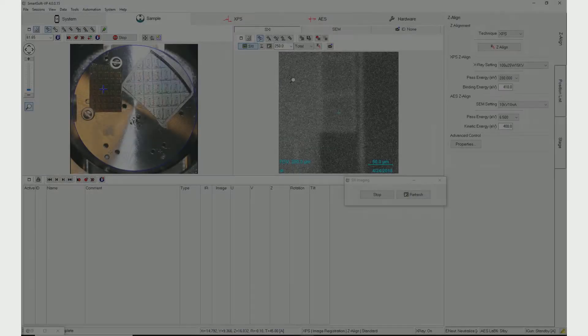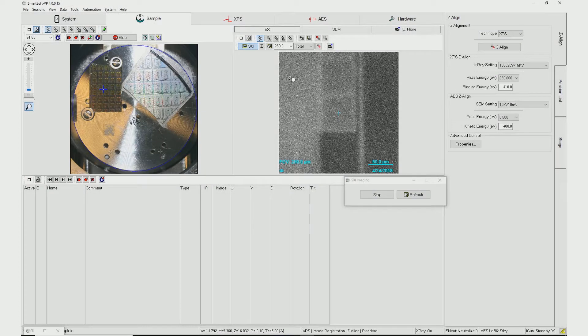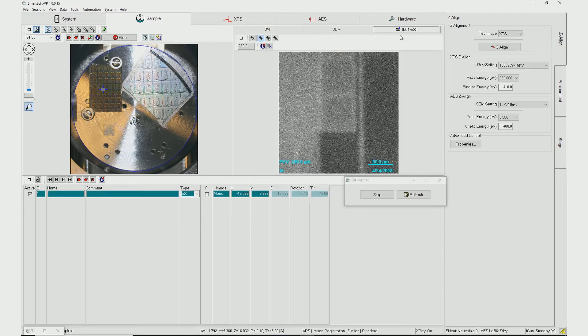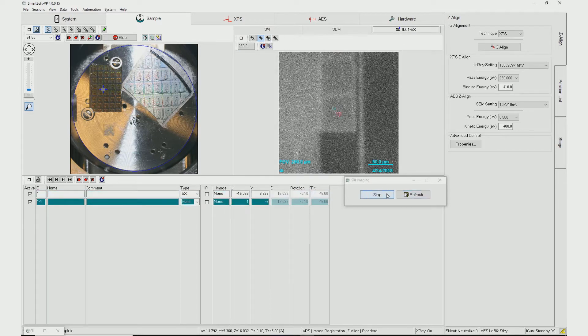As with typical small area analysis, an SXI is generated for each feature, and the point or points of interest are selected. This SXI image can then be designated as a reference image for Image Registration.